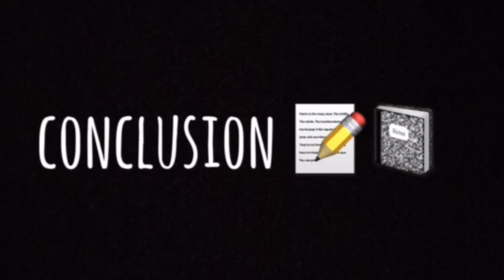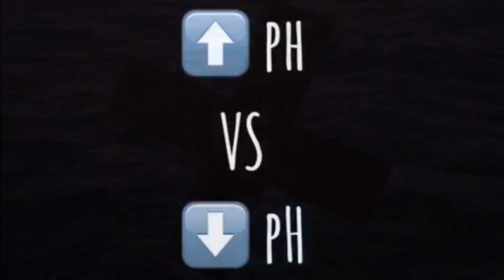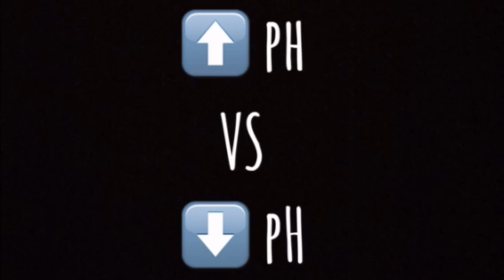Our hypothesis was right to some extent, but lacked some contextual ideas, and our reasoning behind our hypothesis was a little faulty. The pH of our ocean water did not match that of the actual oceans, but this could be due to the fact that it has been away from the ocean for a while and isn't exposed to everything that the actual ocean water is. The highest pH was found before carbon dioxide and calcium carbonate were added, and the lowest was found after calcium carbonate and carbon dioxide were added.